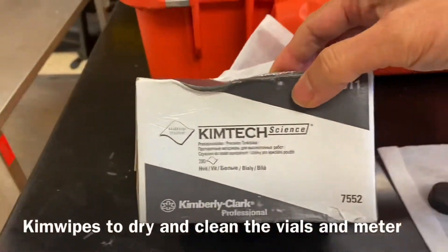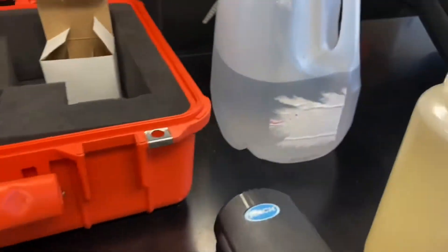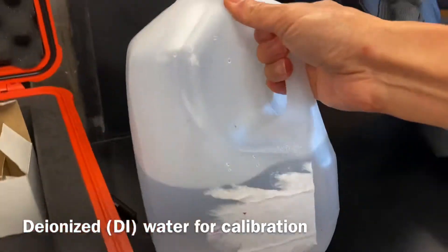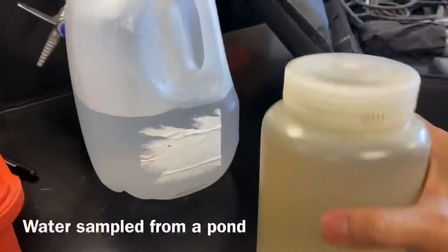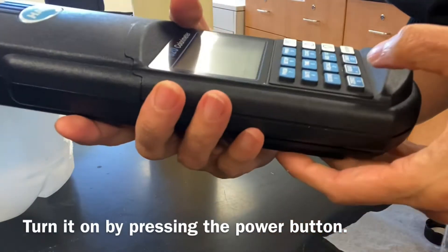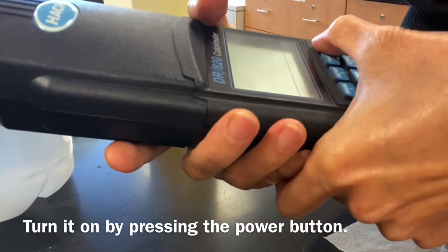Turbidity is measured by shining light through a water sample and recording the light scattered by the sample. The more suspended matter there is, the more the light is scattered, and therefore the higher the turbidity reading will be.